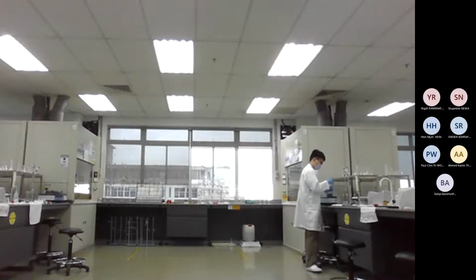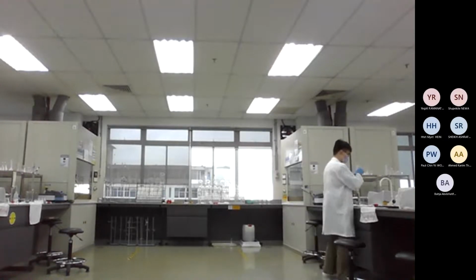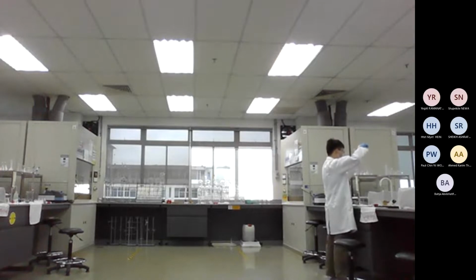Do we use the diluted one or the undiluted one? This is the concentration. Do you have this concentration? 6 times 10 to the power of minus 3, that means 0.006 molar. Do you have that 0.006 molar? Yeah, 5 milliliter. It should be given, right? Is it given? Do you have it?